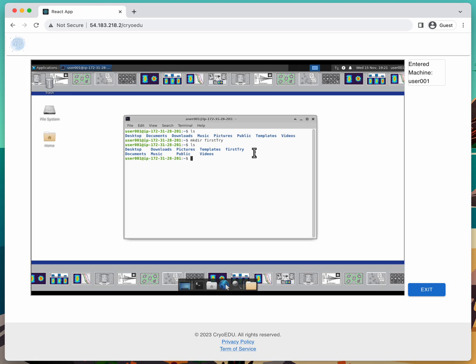So each time you come to the simulator, you should create a different folder. So now we will go into this directory with a command called change directory or cd. And what this will do is move us into the folder. If I type out the folder name, I'm now in this folder and the folder is empty.